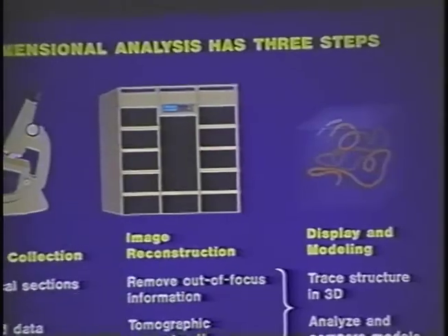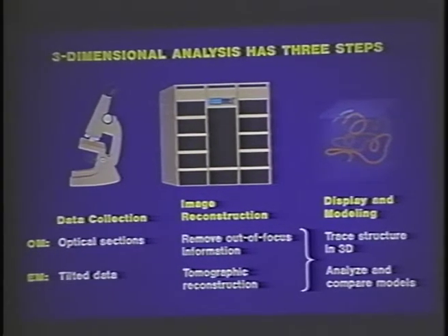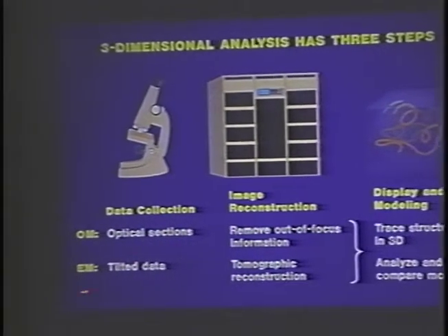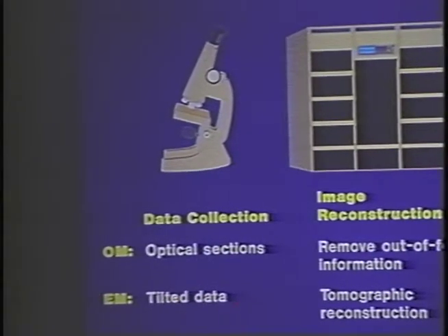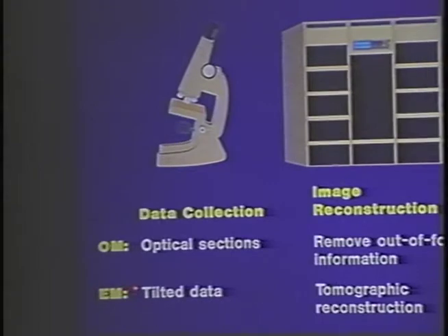Now, the actual doing of this is a complicated process and is broken down into what we feel are three critical areas. The first area has to do with data collection, for actually collecting high-resolution tilt data sets, and I'll be telling you about approaches that we've taken to both automating this as well as to collecting very high accuracy data.